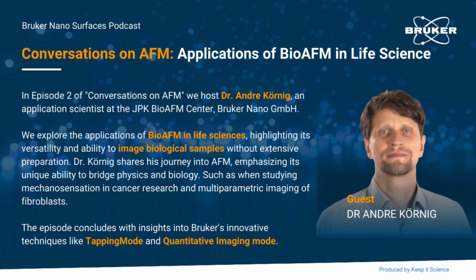Yeah, I think there's lots of really interesting points, especially as you mentioned, it's becoming easier to use and probably also more commercial systems are available for people to use. Whereas 10 years ago, probably a lot of people had to self-build microscopes, especially high-end and specialized microscopes. Exactly. So it's great to see it really come to the market.